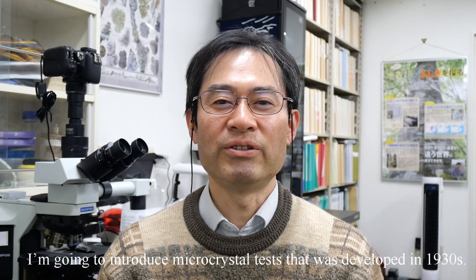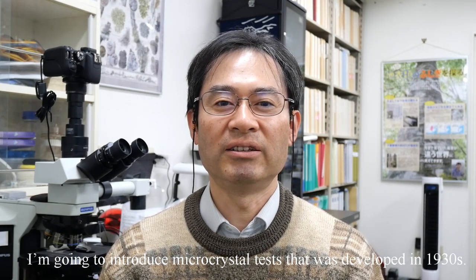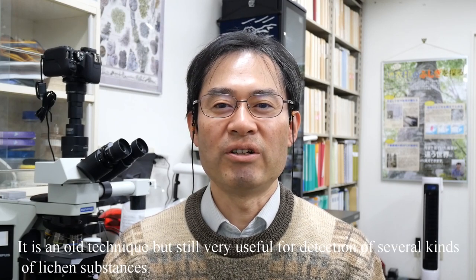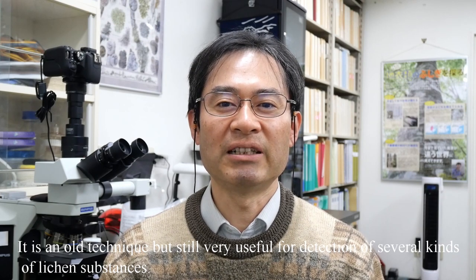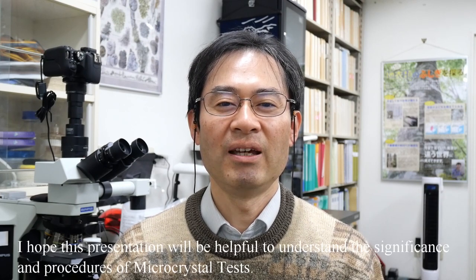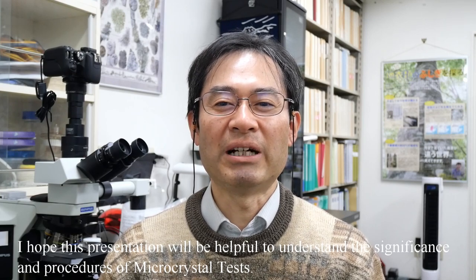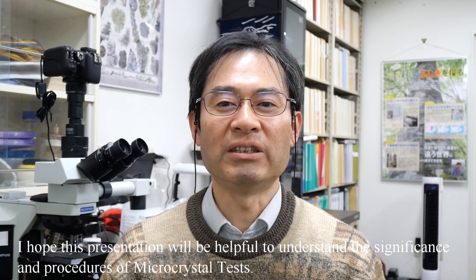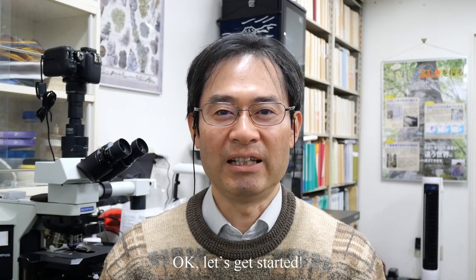I'm going to introduce the microcrystal test that was developed in the 1930s. It is an old technique, but still very useful for detection of several kinds of lichen substances. I hope this presentation will be helpful to understand the significance and procedures of microcrystal tests. Okay, let's get started.